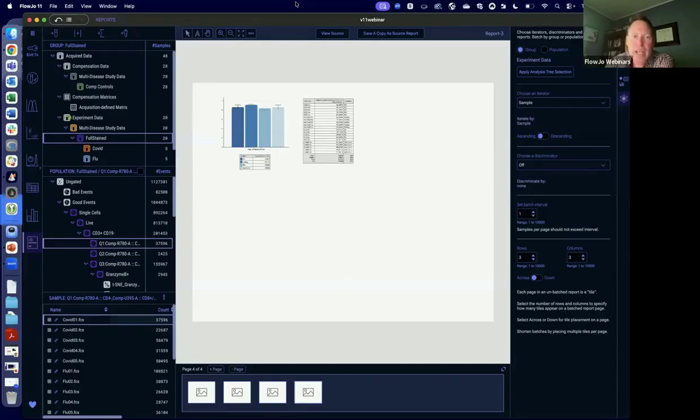Let me just check the chats and the QA. We are 2 minutes over, so sorry I ended up choosing a much longer running T-SNE than I intended. Okay, and we are good with chats and Q&A questions.